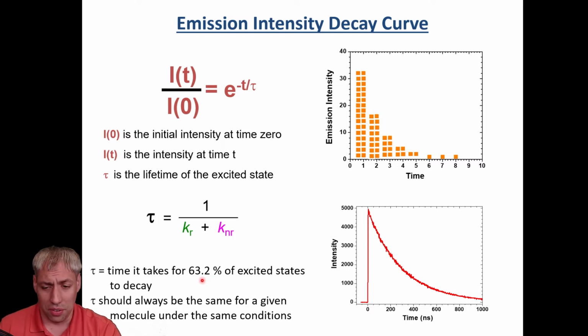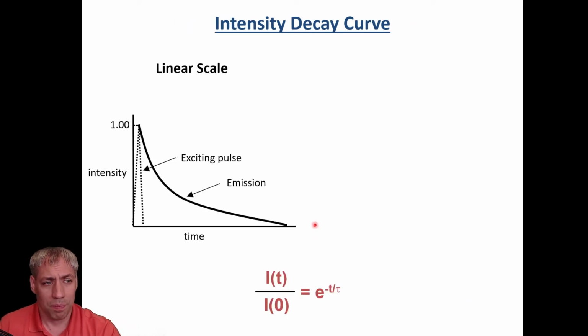And so this is an intrinsic property of molecules. If you measure the same molecule in the same solution at the same temperature anywhere in the world, you should get the same lifetime because it's an intrinsic property of those molecules.